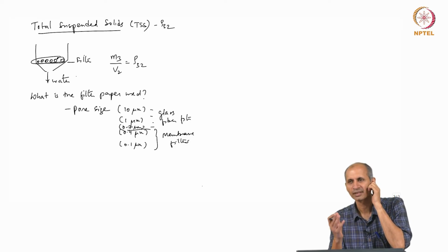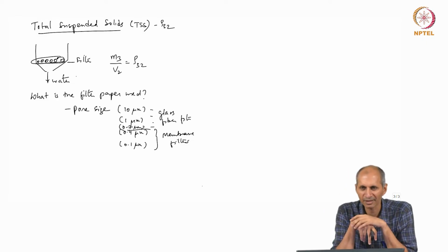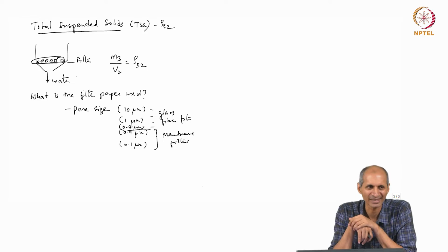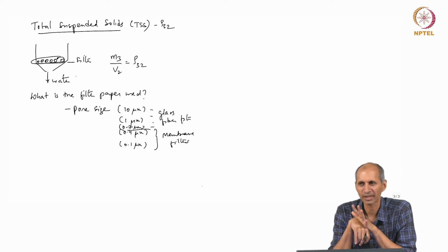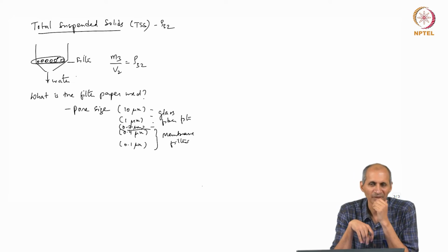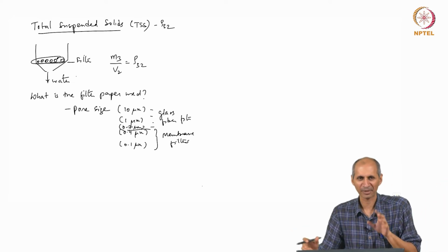Is there a qualitative, rational decision why you may want to use one or the other? People who have done filtration will know what the difference is. What is your objective? We had all these example analysis problems for this question.